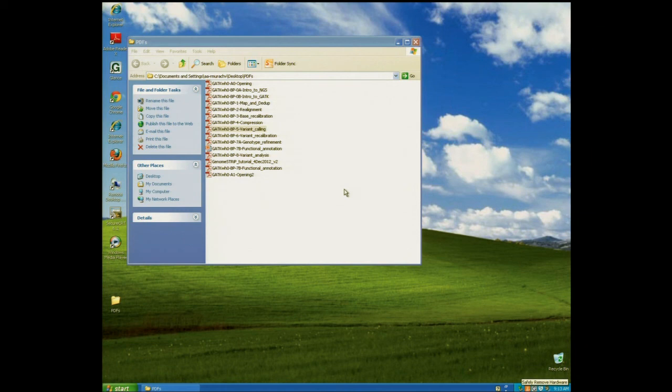The two main workhorses that the GATK uses for detecting variation are, first of all, Unified Genotyper, which is our legacy tool, and the newest, fanciest, state-of-the-art tool, which is the Haplotype Caller that Ryan is going to talk to you about. So I'm going to start talking about Unified Genotyper in a second.